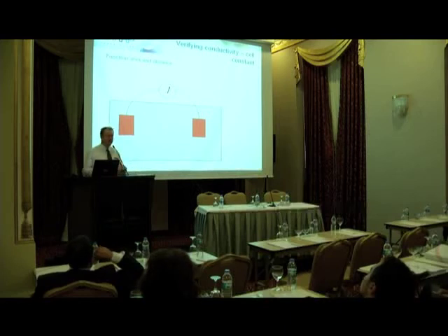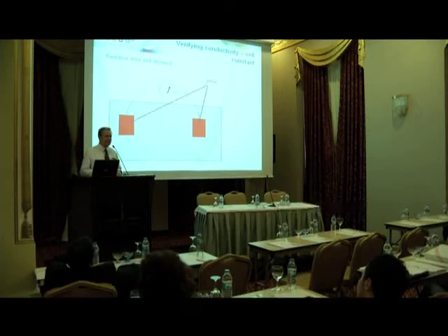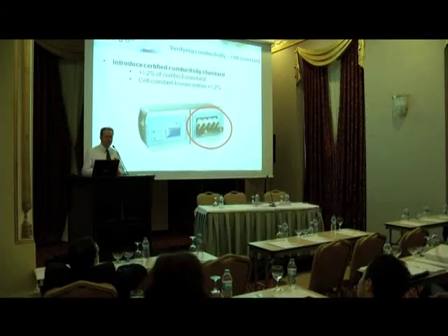The cell constant is a measurement of the size of the conductivity sensor and the distance between the plates. And the way we check that is by using a certified standard, a conductivity standard. We put it through the analyzer and then we say yes, it is measuring correctly according to the certificate of analysis supplied by the laboratory.